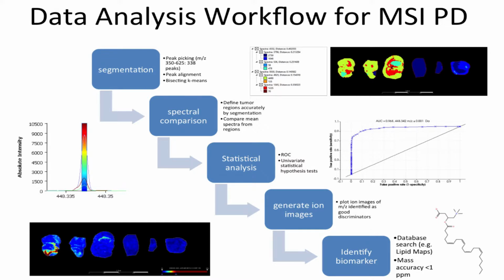So basically, this is really fresh from a few days ago, work that Elizabeth did, starting to develop some data analysis workflow to look at if we would be able to develop some pharmacodynamic approaches from that mass spec imaging data that we are already acquiring.